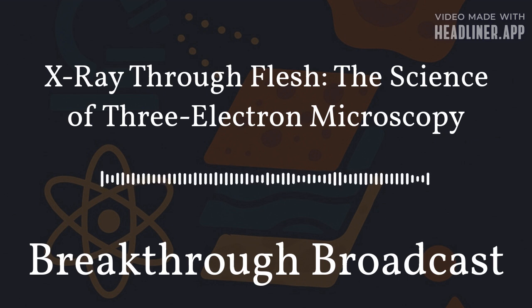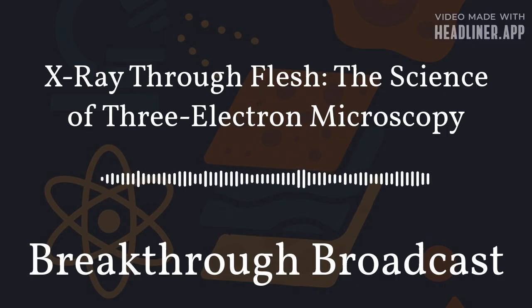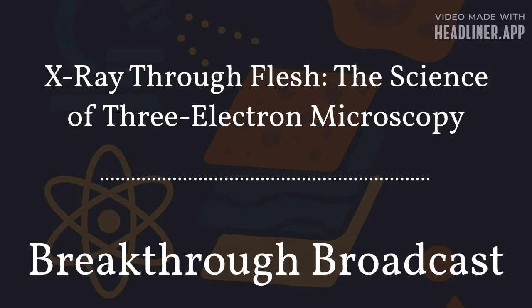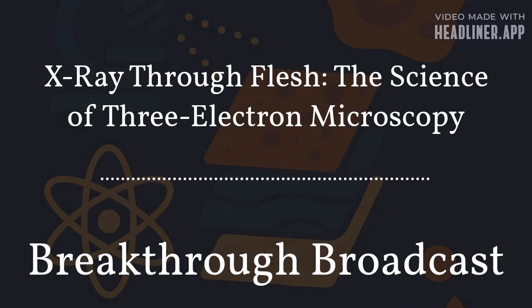Transmitted electrons provide the third viewpoint and are the most essential to three-electron microscopy. These are electrons that pass through the sample rather than bouncing back or being ejected. The amount of electron transmission depends on thickness and density. Dense or thick regions transmit fewer electrons, while thinner or less dense regions allow more to pass through. Capturing transmitted electrons gives scientists a direct view of internal structures without physically slicing the tissue into ultra-thin layers. This is especially valuable for samples that would normally require complex or destructive preparation.